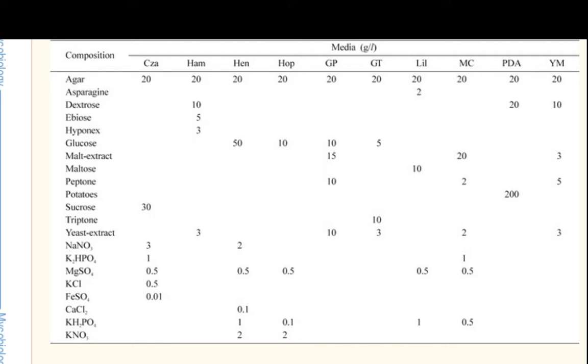So now, the sucrose is added to the agar, but it's not added to the potato dextrose. Now potato dextrose, I'm assuming potatoes have the dextrose already in it. The corn sugar has dextrose in it too. So they're really compounding the dextrose in that solution. Oh wait, the potatoes are down here. The sugar has fructose.